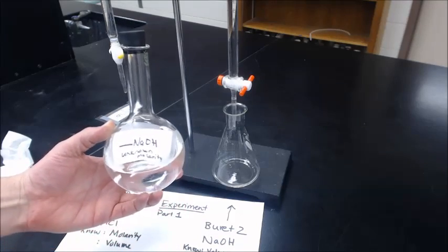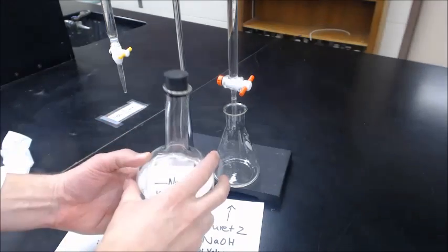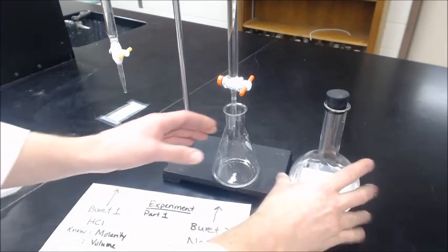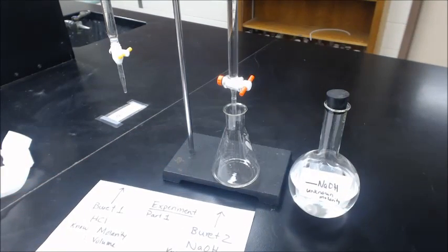So you're going to know that now. That's called standardization. Now this is standardized, and we're going to use that for part two.